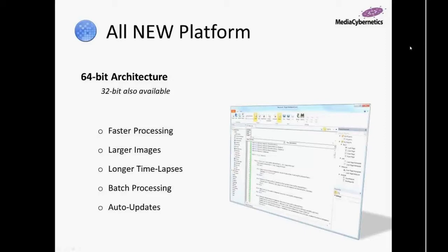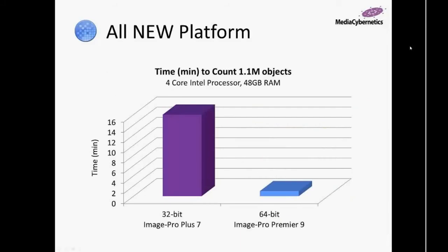At the same time, we're able to download the latest and greatest versions when they do become available. We now have auto updates baked right inside the product. If you have an internet connection, you can simply look for these updates or even have the option selected to notify you when an upgrade is available.